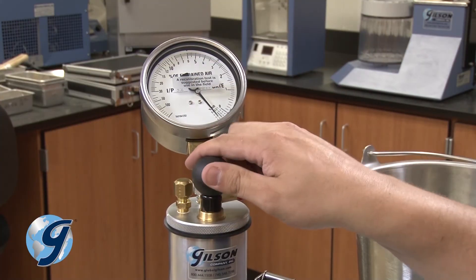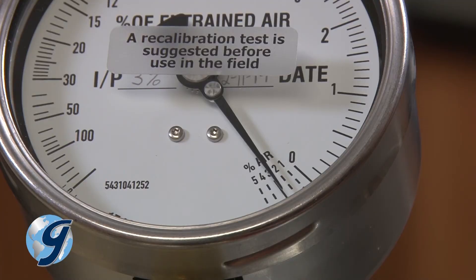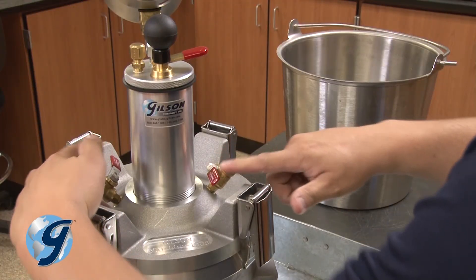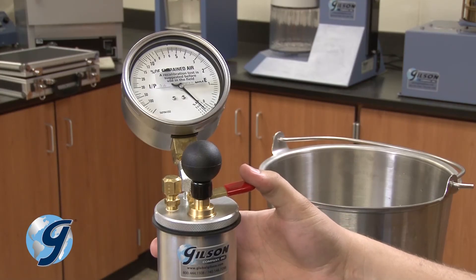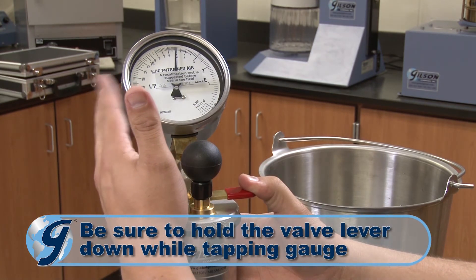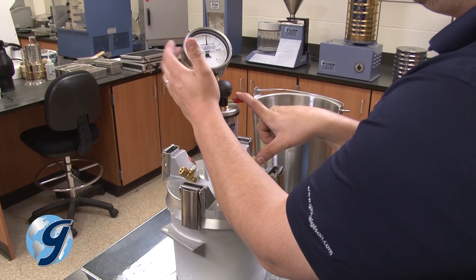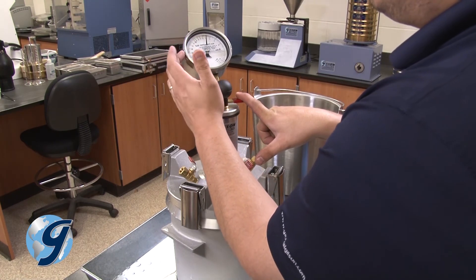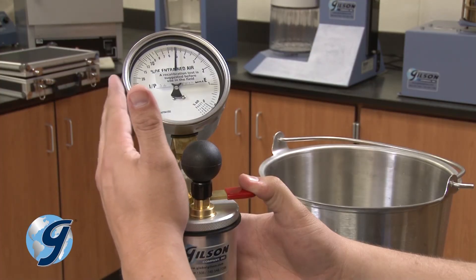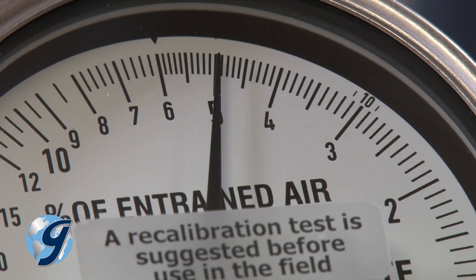Pump the unit back up to the predetermined initial pressure mark, making sure to lightly tap on the gauge body until it stabilizes. Now press down on the needle valve lever to exhaust the air into the base, making sure to hold the lever down while again lightly tapping the gauge body until the reading stabilizes. The gauge should read plus or minus 0.1% from the correct air content as determined by the calibration of the calibration vessel. In this demonstration the value is 5%.